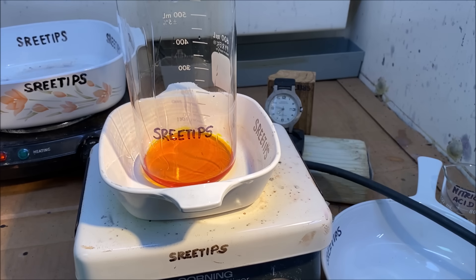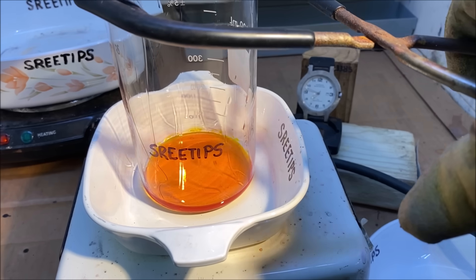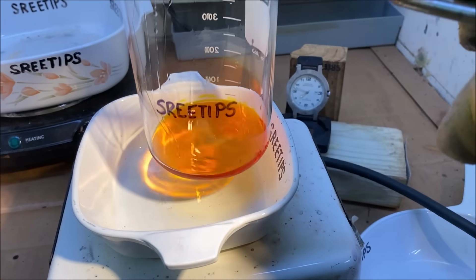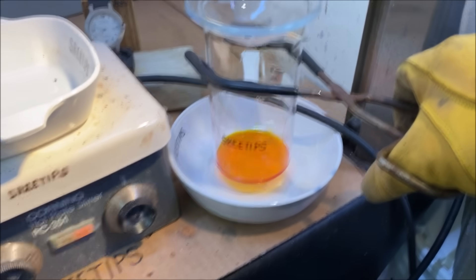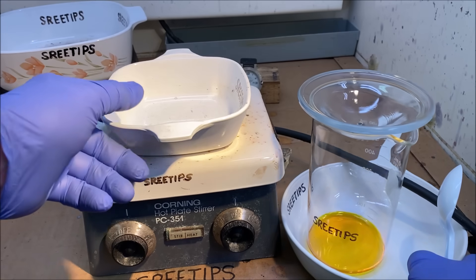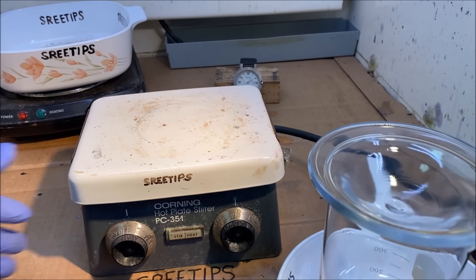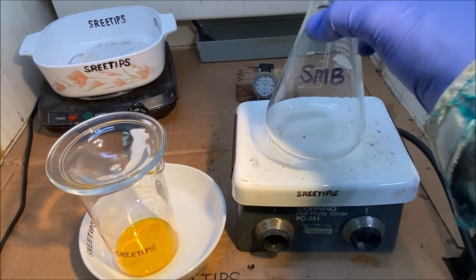I've got this all dissolved — it took several hours — and I'm getting the solution evaporated down until there are no more fumes in it. I'll pull it down now and let it cool off.